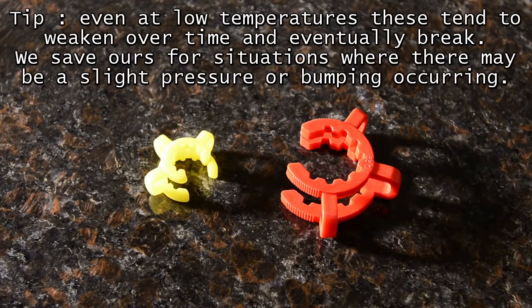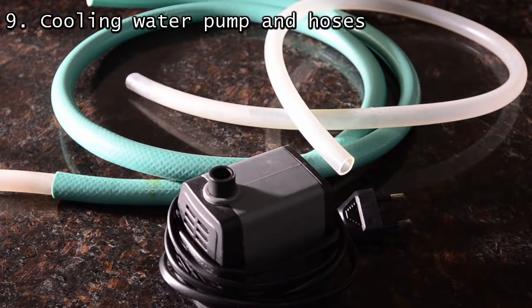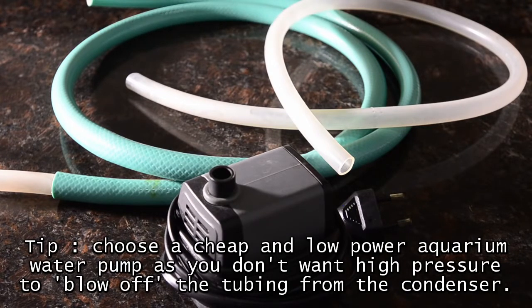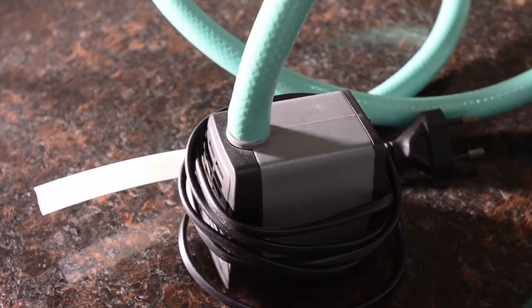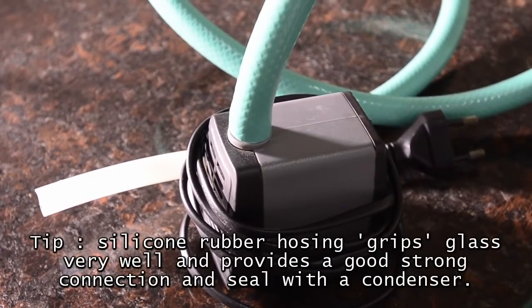We tend to use these only when really necessary. For distillation, you will also need a source of cooling water. We use a bowl and an aquarium water pump — just choose the cheapest and lowest power one, as this should be enough; you don't want too much pressure. We also use silicone tubes, which fit very well with the condenser glass and don't easily come off.